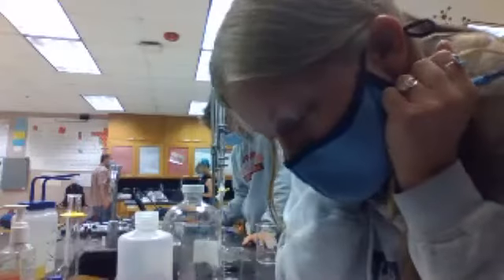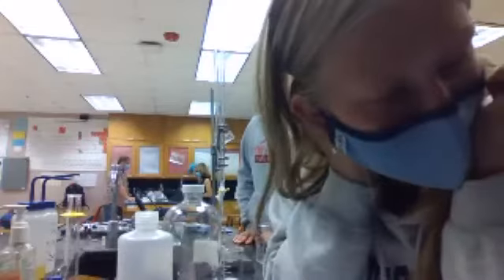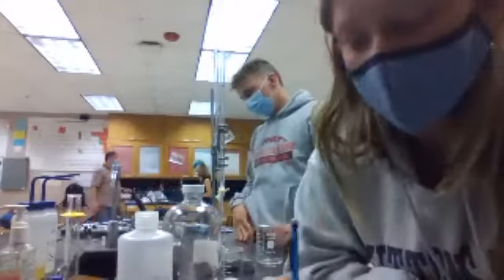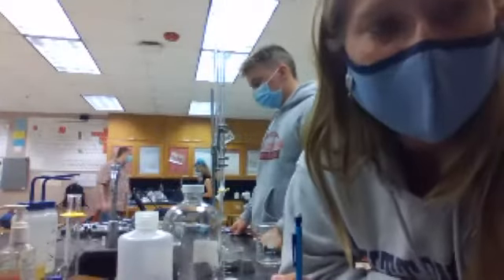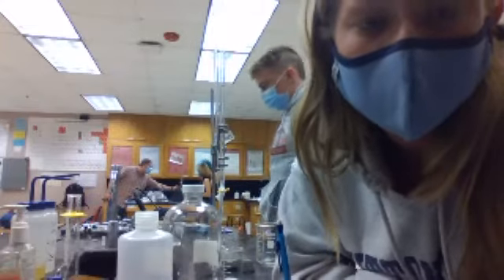Yeah, but why do we need the concentration? To find the final volume of the NaOH. Oh, so it's not like last time where we have a final. It is like last time. We used the formula again. No, you're fine, because when we do inverse log of the pH, that finds the molarity of the acid. You can't go lower than this line otherwise. Yeah, we got it.